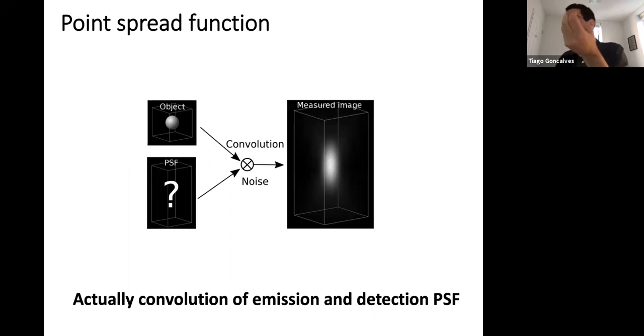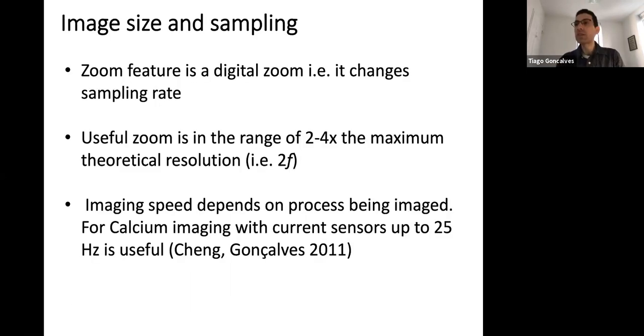You can do this with beads. Fluorescent beads are little microspheres that you can buy from Invitrogen or whatever it is called now. It used to be Molecular Probes, now I think it's Thermo. You can have them smaller than the resolution of your microscope, so you know that they're a diffraction limited point. Then you scan them and see what kind of shape you get out of them, and from there you can calculate your point spread function and see what a single diffraction limited point translates to.